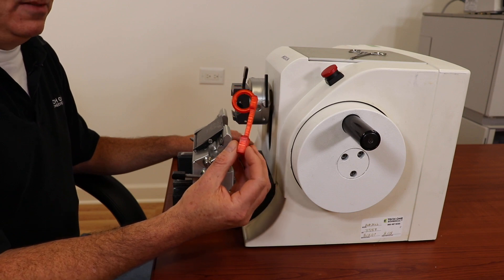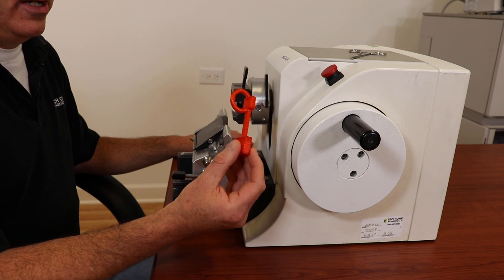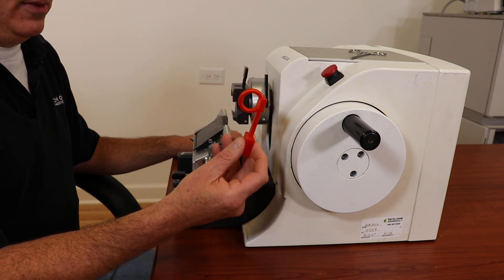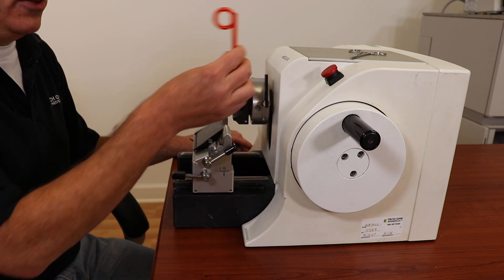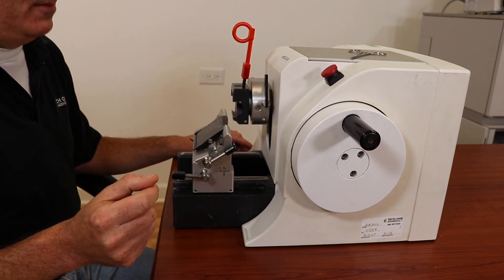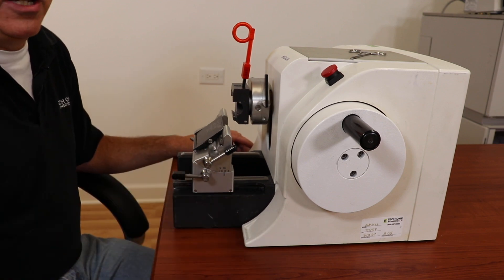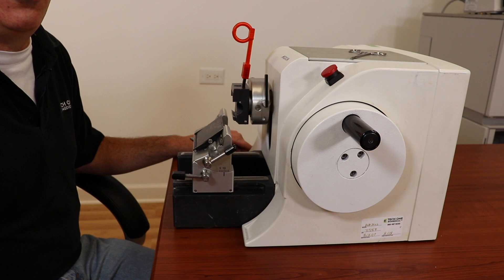Newcomer will also be giving them away. Keep in mind there's a very limited supply because my printer doesn't go that quick. Also keep in mind this is a plastic prototype, and while it does work, the final model will be a lot more durable. So if it breaks, just know that this is a prototype and it's not intended for long-term use.